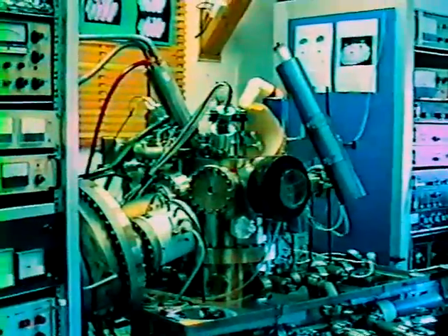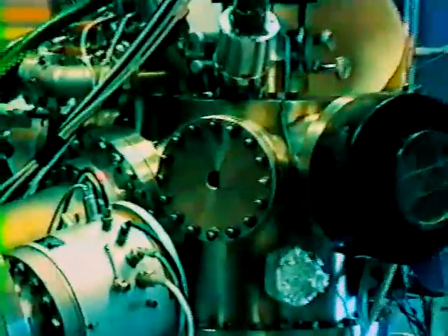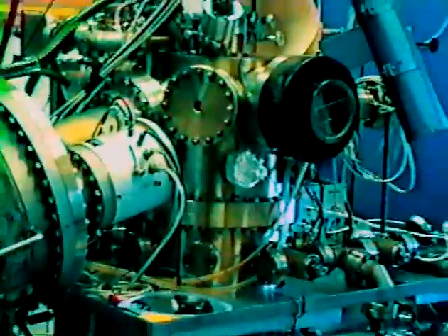Well, this is another type of our UHV systems equipped with a hemispherical analyzer, and in this UHV chamber Károly Révész is studying the photodissociation of different halogenated hydrocarbons.